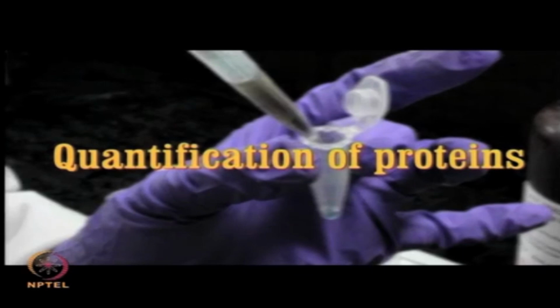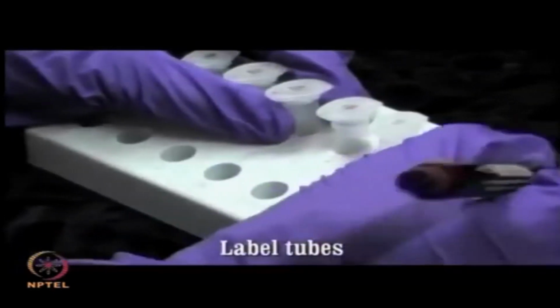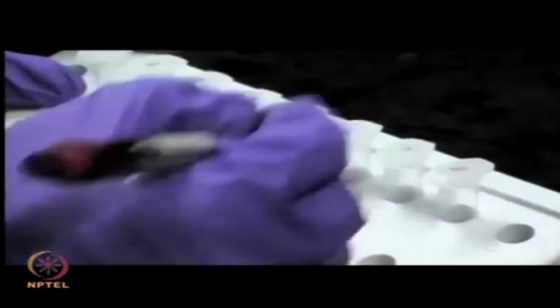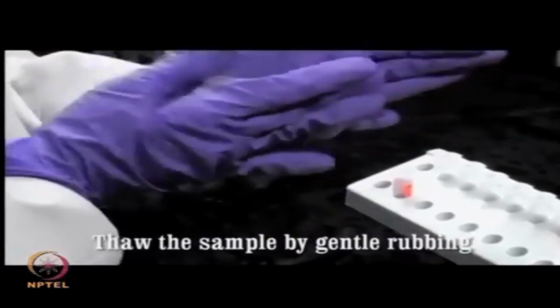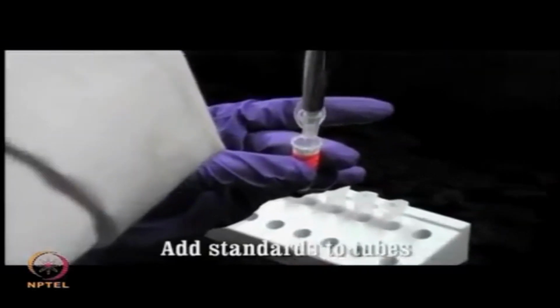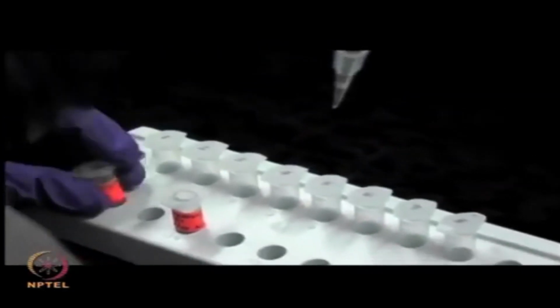Quantification of proteins. After the protein sample has been extracted from its source, it must be quantified to determine the protein content before any further processing. Label the tubes suitably for standard and test samples. Thaw the protein sample to be quantified by gently rubbing it between the palms. Prepare the sample buffer required for diluting samples during the assay and mix it well. Add an increasing concentration of standard protein sample to each of the designated tubes.